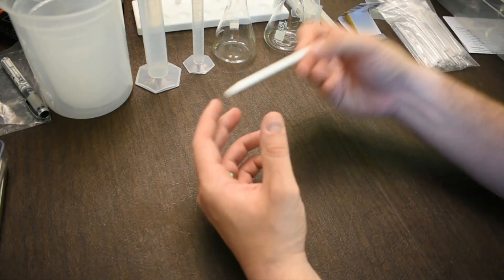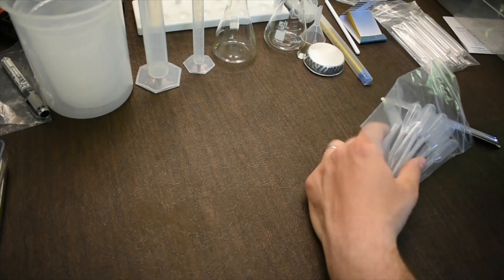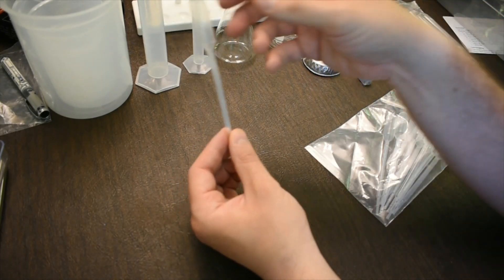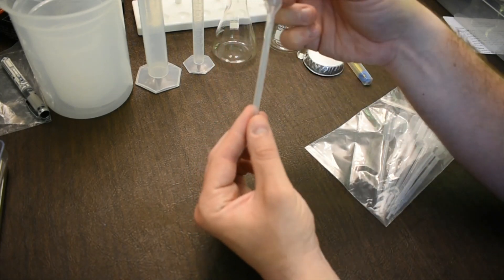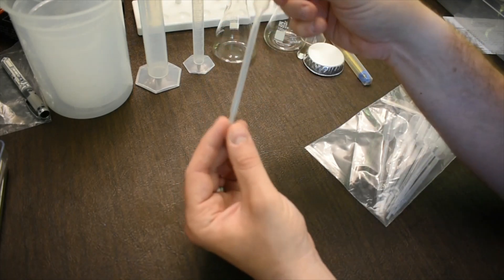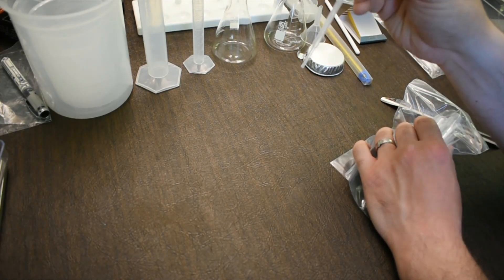The stirring rod is just a piece of plastic used to stir things in solution. Also very important are the plastic pipettes, which are used to transfer solutions from one container to another and to add things dropwise — for example, acetic acid. They are graduated but only approximately, so if you need about one mil, pull up to the one-mil mark. They're great for slow, controlled dropwise addition.